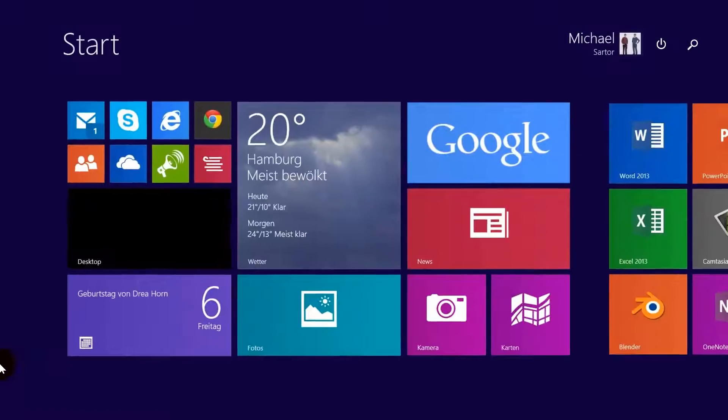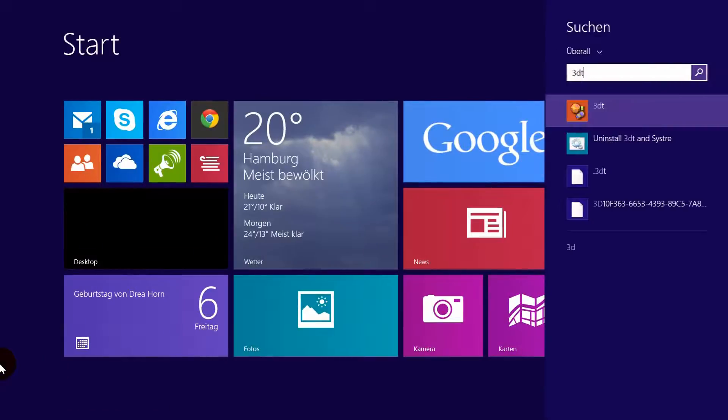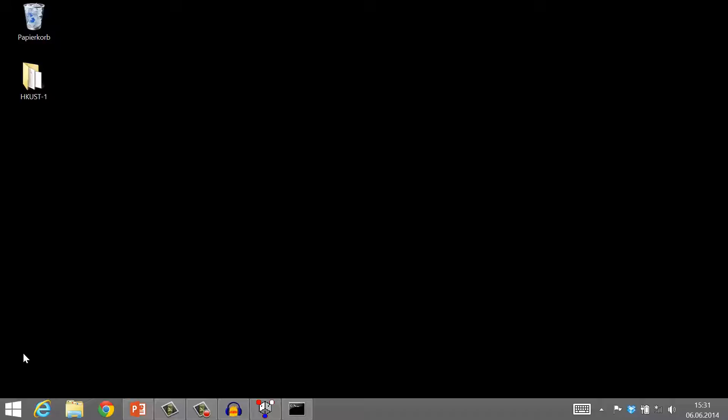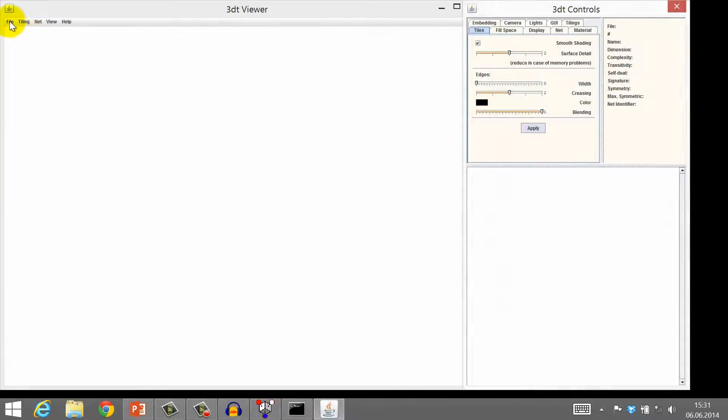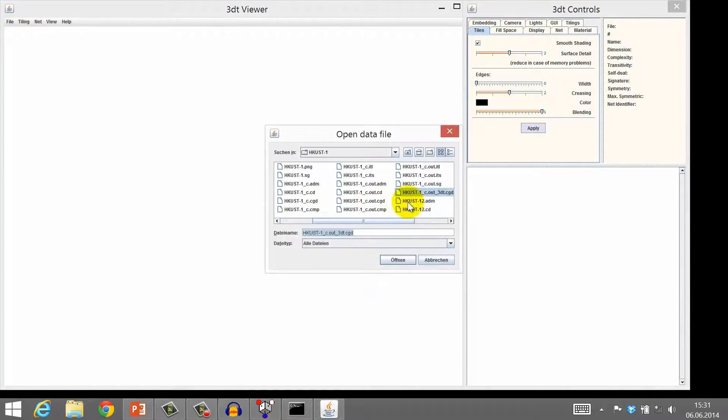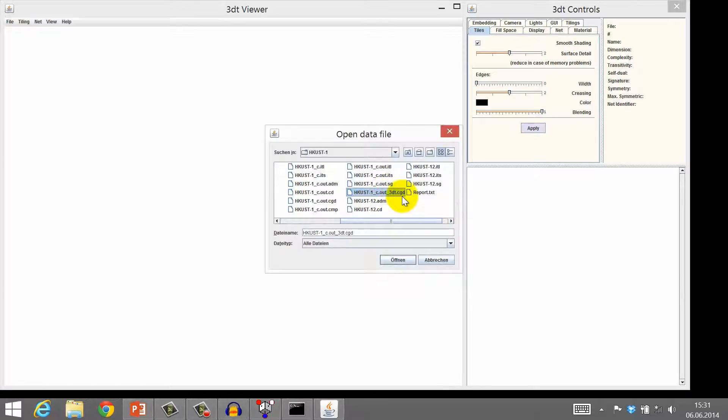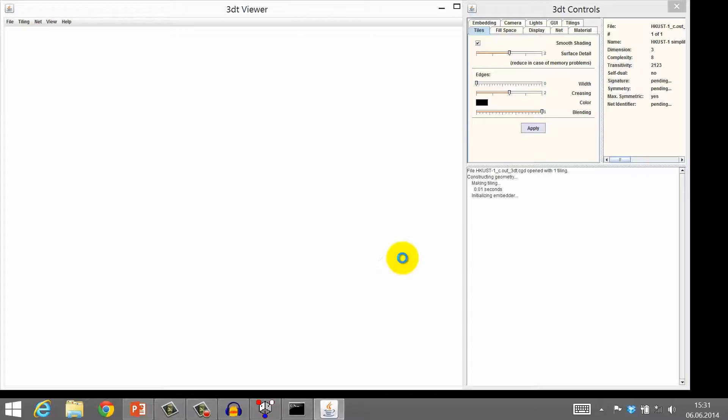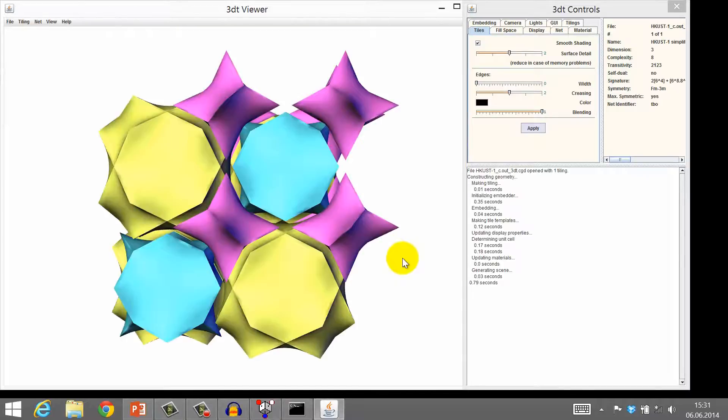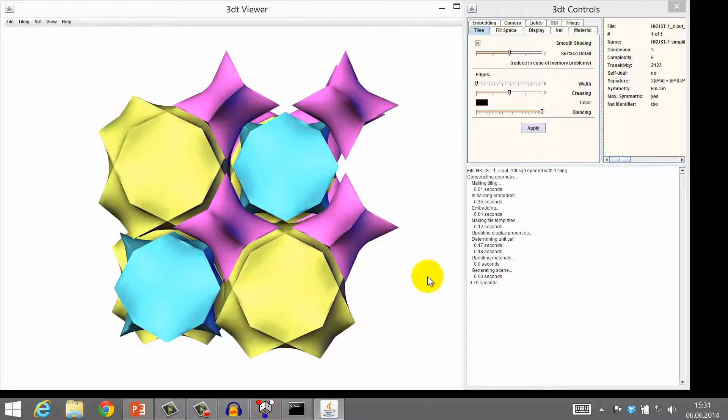Now, launch 3DT and open the file HKUST-1-C-3DT.CGD. 3DT then produces a tiling with random colors. Each class of the tiles is colored differently.